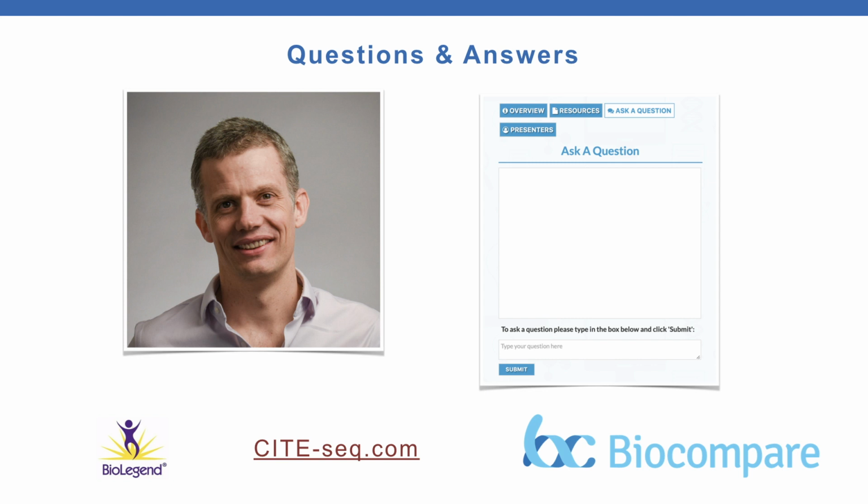There's another thing that you need to bear in mind with this though, which is, I mentioned that with flow cytometry, for instance, you're measuring different fluorophores in different channels, so there's different excitation and emission spectra. So if one fluorophore is 100 times brighter than another, it doesn't matter because you're measuring them independently.